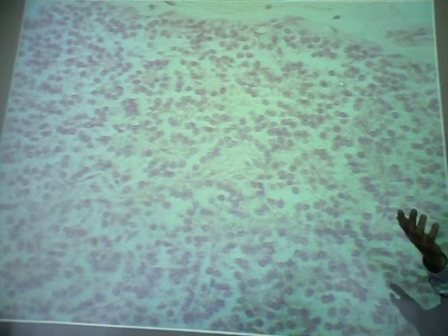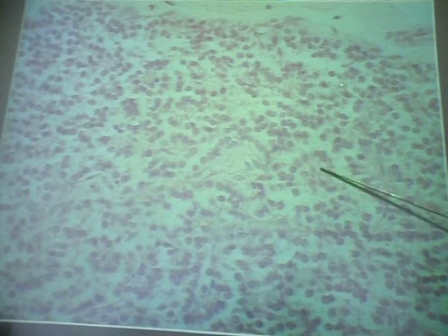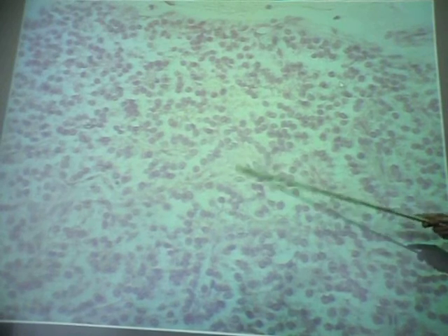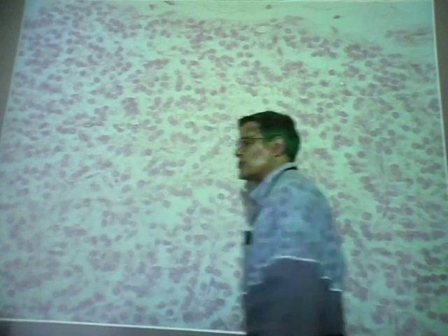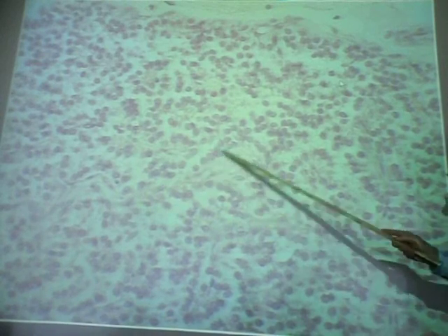So parathyroid hormone has the opposite effect of calcitonin. And again, the cells that produce that are these. What you're looking at are the nuclei of these cells, chief cells. But there are also some other types of cells in here too. They're few and far between, and it looks like there are little spaces here because these cells are a little bit larger. These are called oxyphil cells.